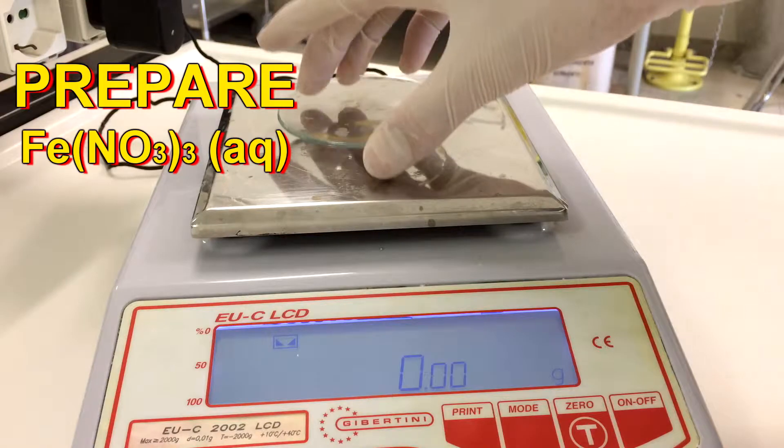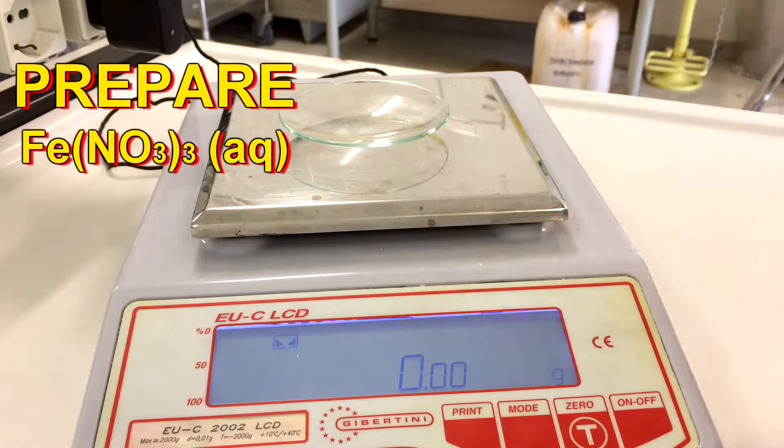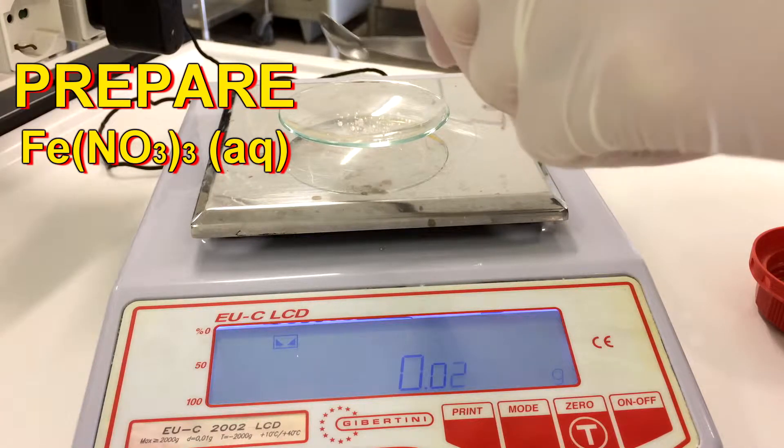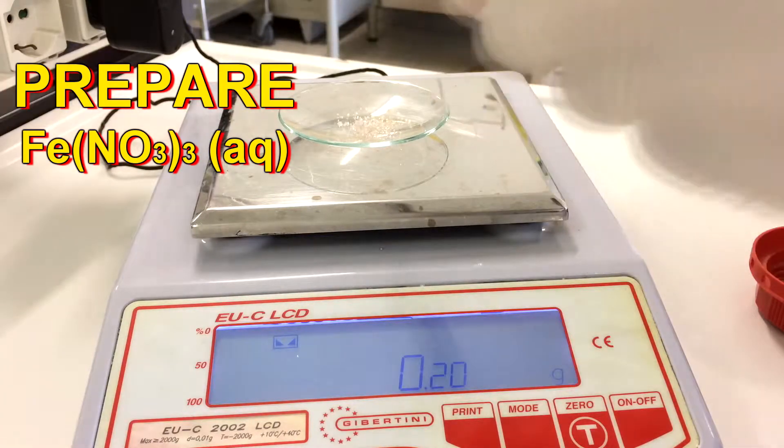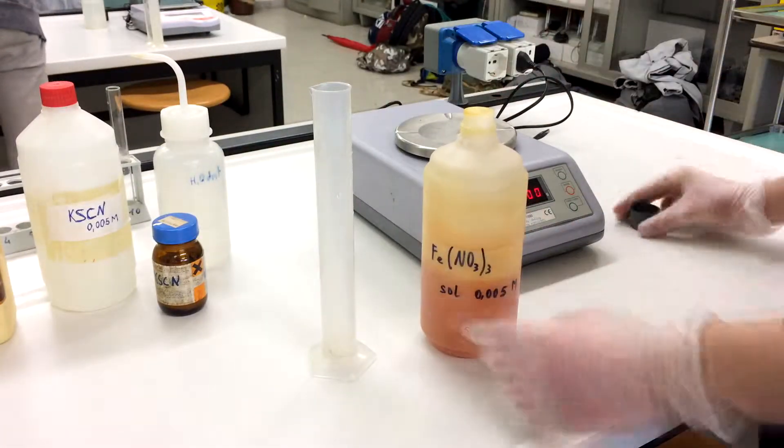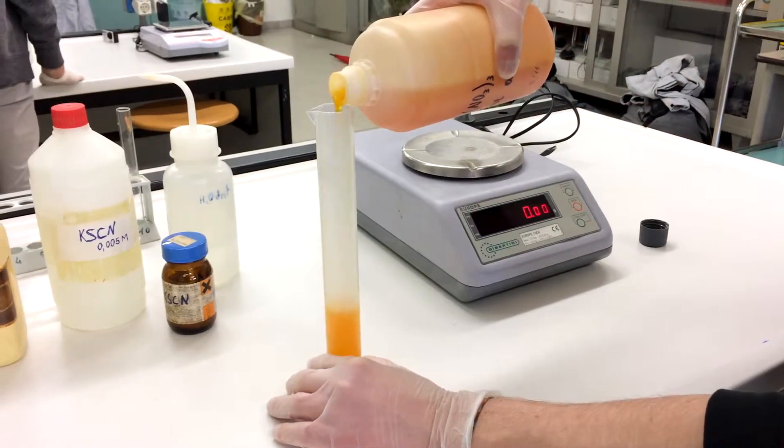We weigh 0.20 grams of ferric nitrate. Then we create the solution of 100 milliliters and pour 50 milliliters into the 100 milliliters graduated cylinder.